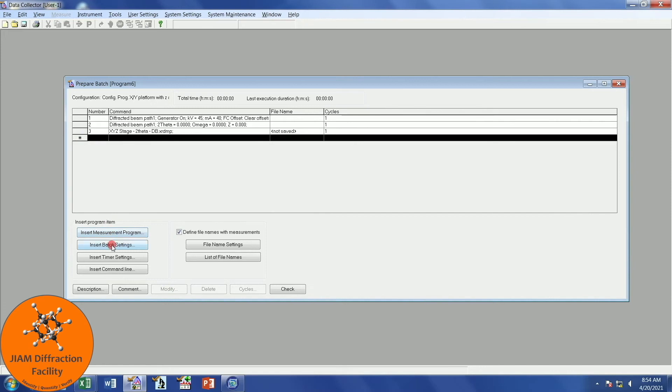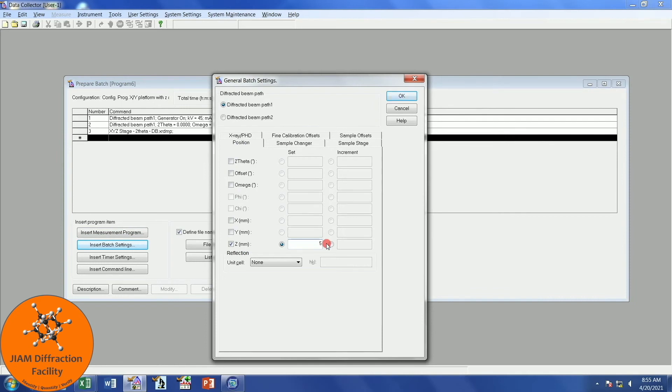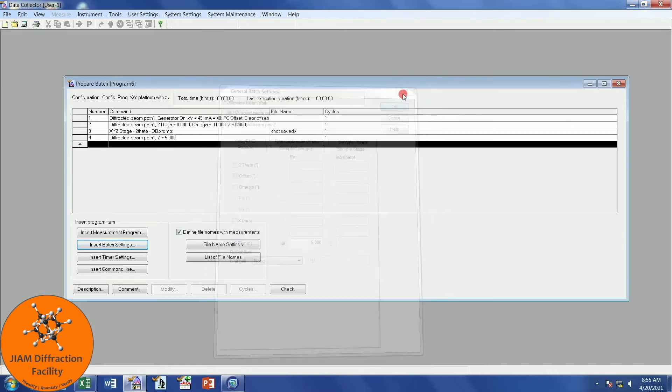Next, we will insert a batch setting. We will go to Position, put a check mark next to Z, and I will change that to 5 millimeters. If you perform your alignment and don't see the feature that you need to see for your Z alignment, you may need to change this value to a larger number. Again, if you have problems, please leave them in the comments section below so I can try to help you out. Click OK.